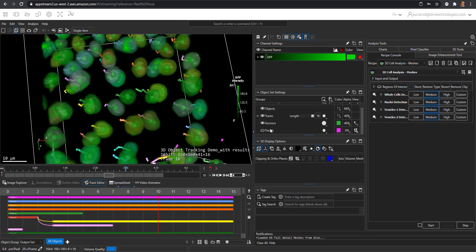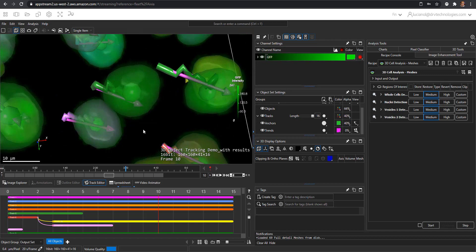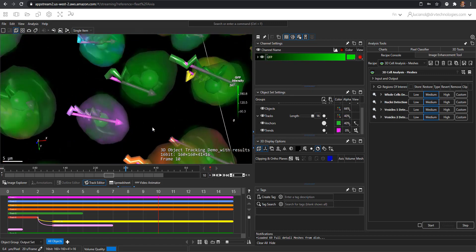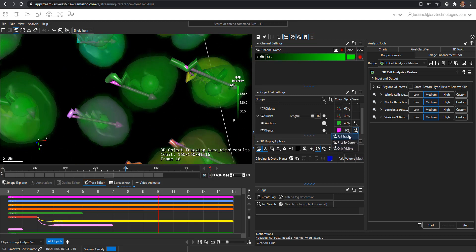We also have available trends, and these are arrows that connect the start and the end point of each track. There are some advanced settings under the trends which you can explore in our Avia wiki pages.